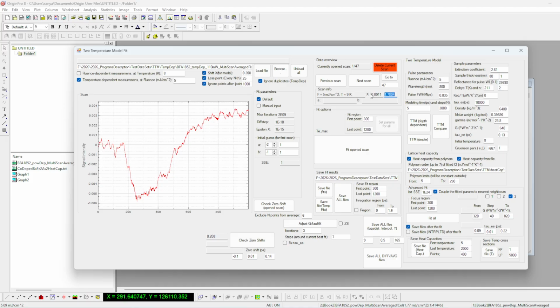Then the first point I can modify by, let's say, using another shift, and then you will see that I shift all of my region. So these are the parameters. Then A, B are thermoreflectance coefficients that you will fit to coincide the temperatures with transient reflectivity in this case. Then another two parameters are the electron-phonon coupling strength, big G.